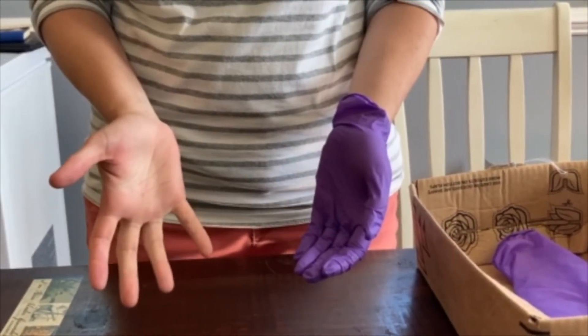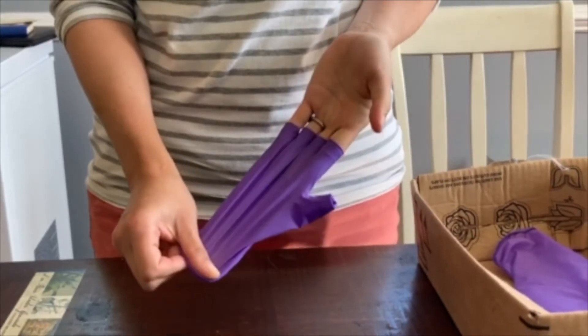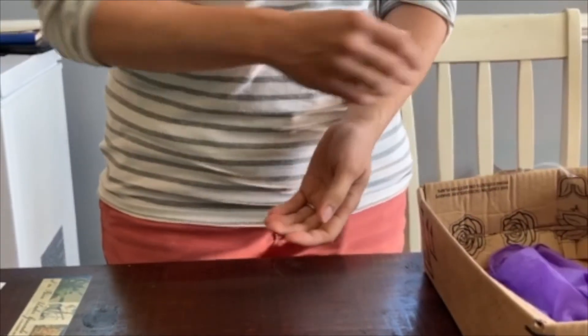Then take the free hand and perform the same action on the opposite hand, using one hand to roll the glove gently off of the wrist and place it in the appropriate receptacle.